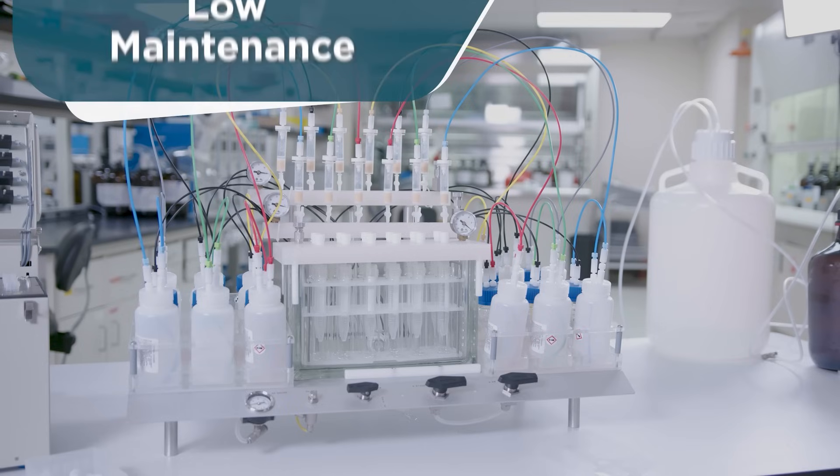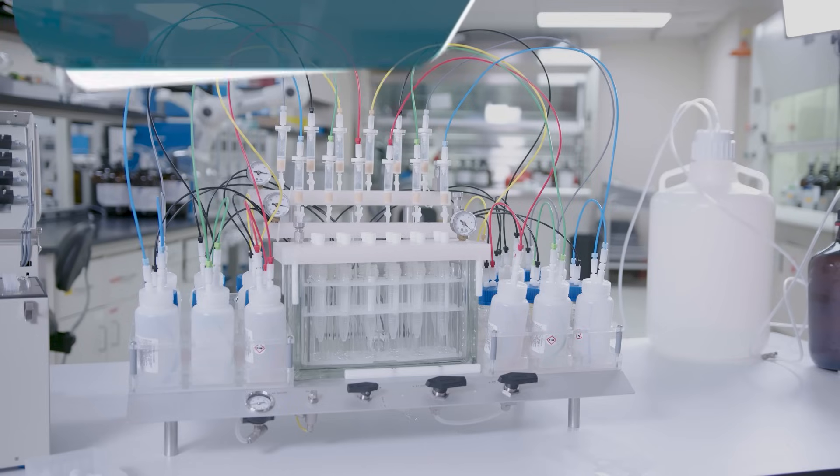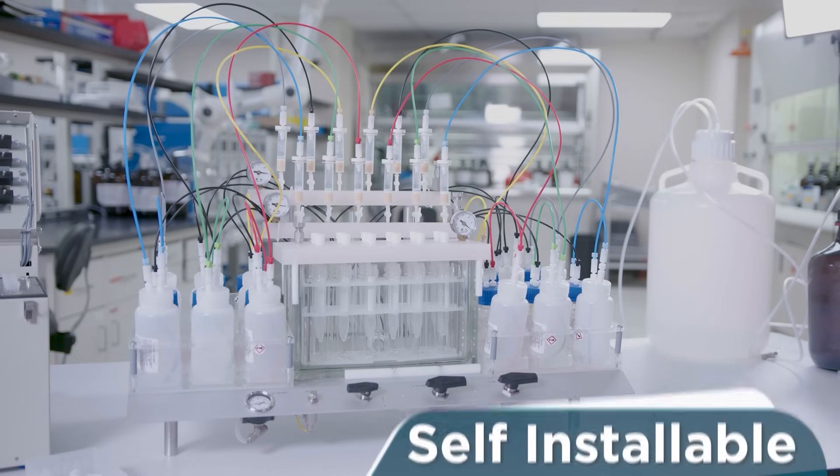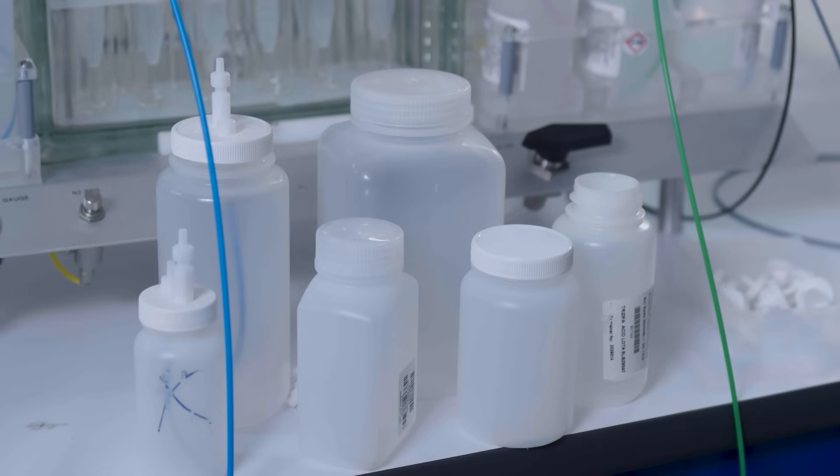The system comes with an unpacking and installation training video. Handles a wide range of sample sizes and matrix types. Uses all SPE cartridge and column sizes.